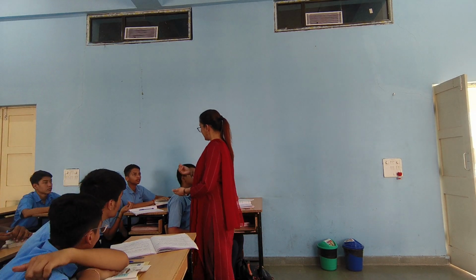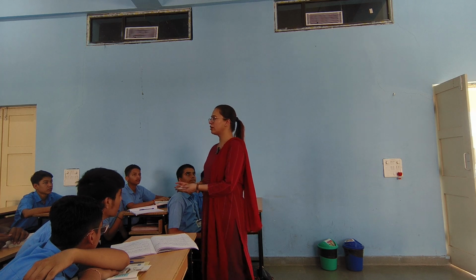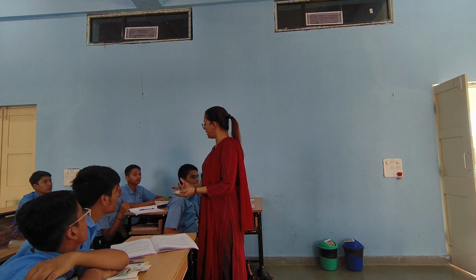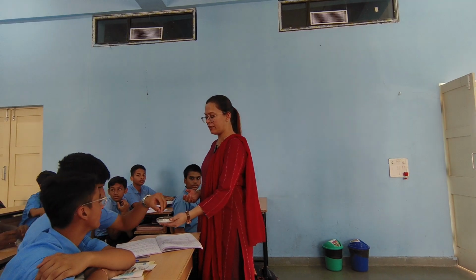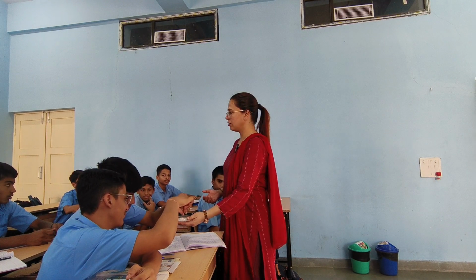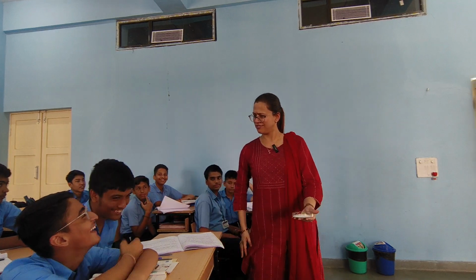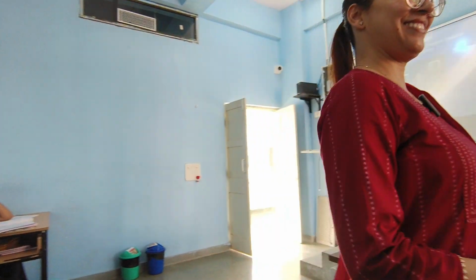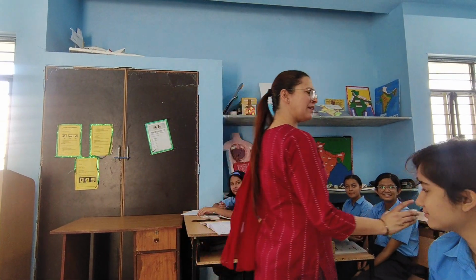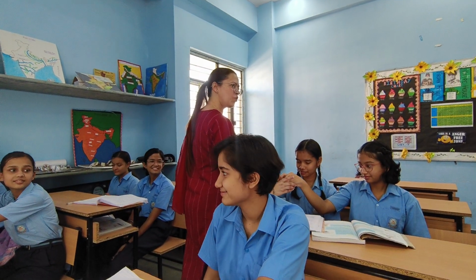You feel that it is powder, but when you touch it, it is not soft. How do we get salt? Initially, we get salt in crystals and then we powder it. Can we eat it? No. Do wash your hands after that, not just now, after the class is over, don't worry.